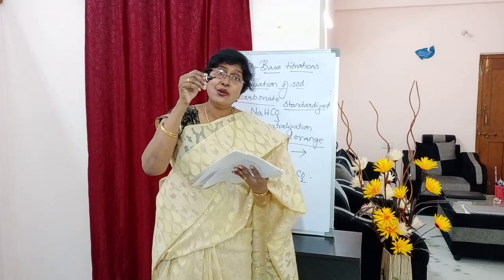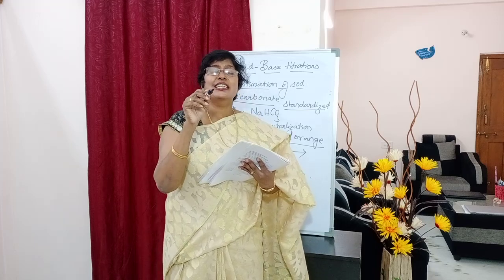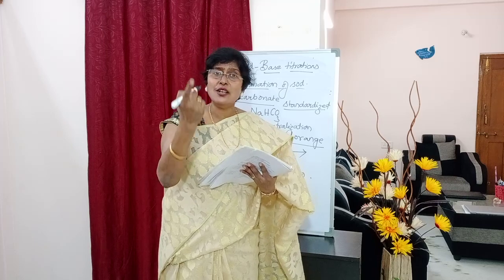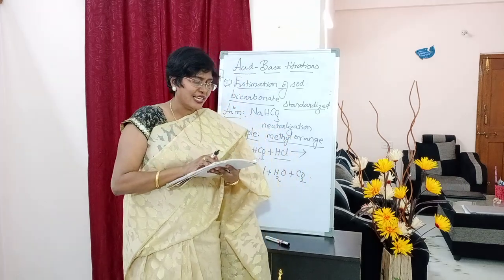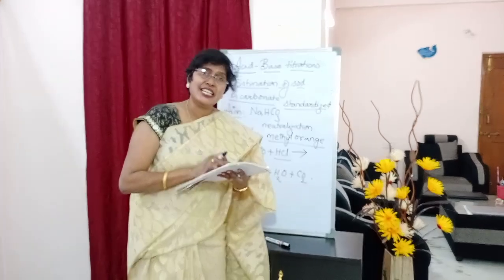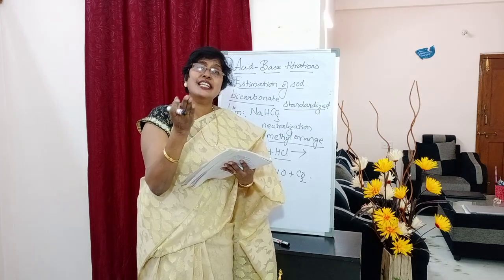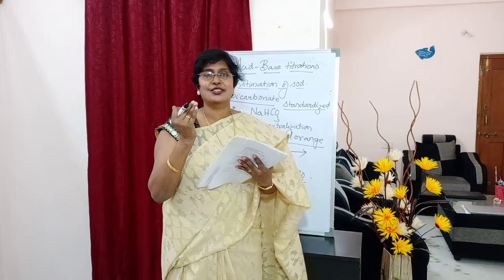The amount of sodium bicarbonate is to be determined. The unknown sodium bicarbonate solution can be estimated using standardized HCl. How is this HCl standardized? Using standard Na2CO3.